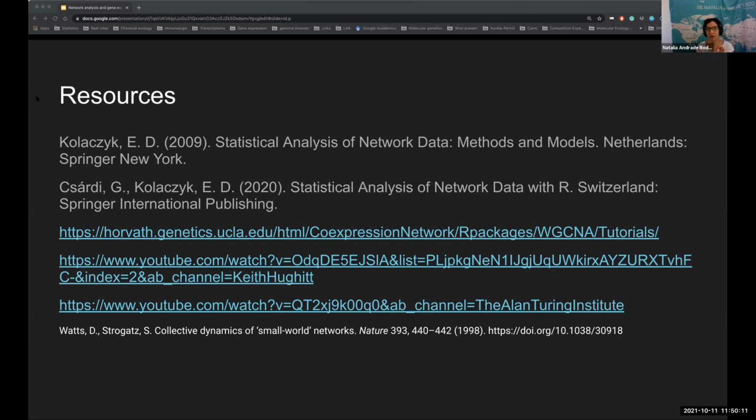I have seen papers with microbiome abundance data and gene expression, and they merge them to get modules related to changes over time. Actually, that's why I wanted to do this presentation, because I want to try to use network analysis to merge these two types of data sets.